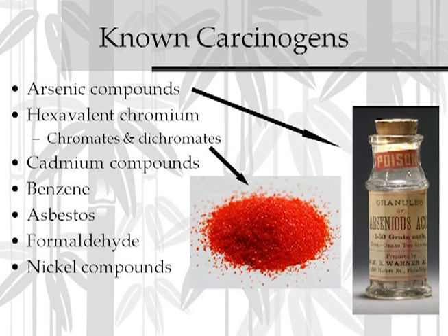If you don't know what the holding solution, the liquid that's holding those tissues, is, if you don't know what the holding solution is that's holding those preserved specimens, I would assume that it's formaldehyde and get rid of that stuff. Formaldehyde is a known inhalation toxin, creates a horrible allergic reaction over time and exposure. A lot of old biology teachers can't be around permanent pressed clothing, pressed wood, new carpeting. All of these things have formaldehyde in them and can create a real serious reaction, asthma symptoms, that type of thing.